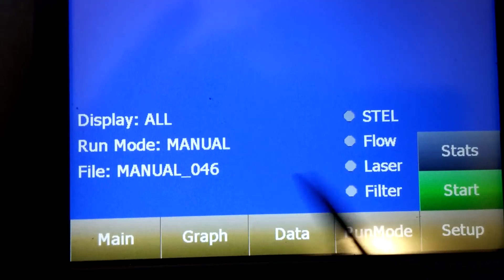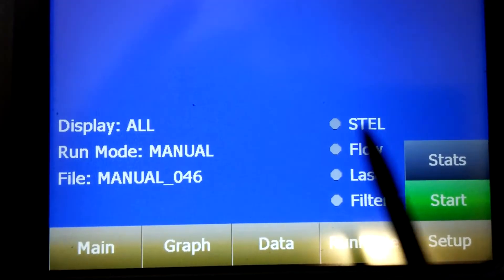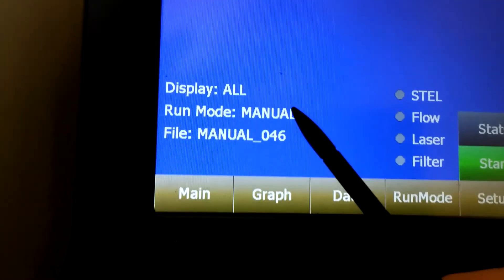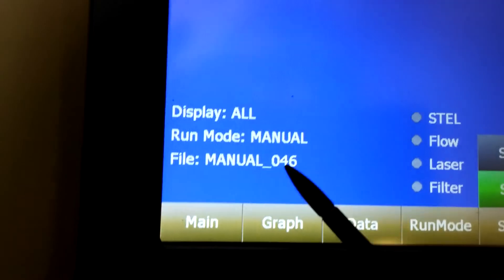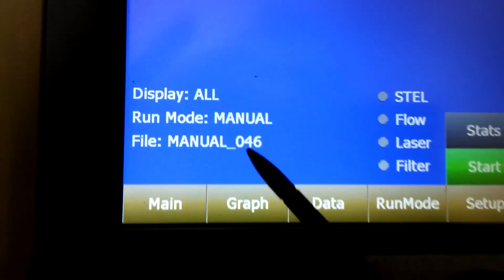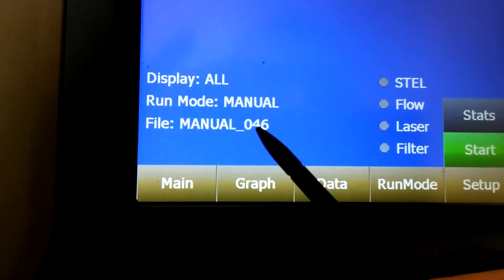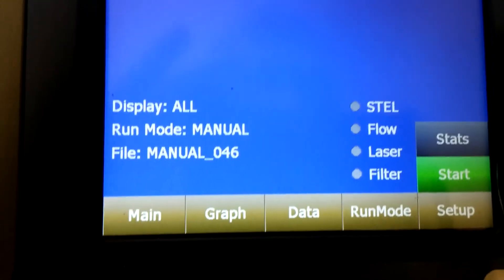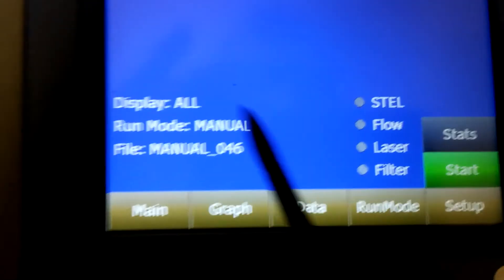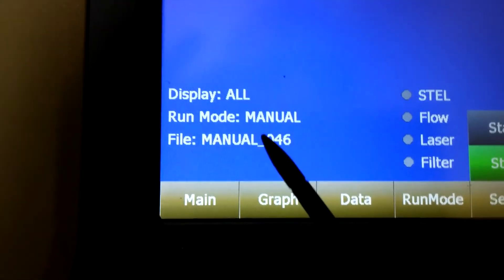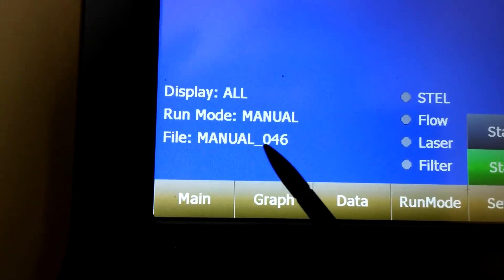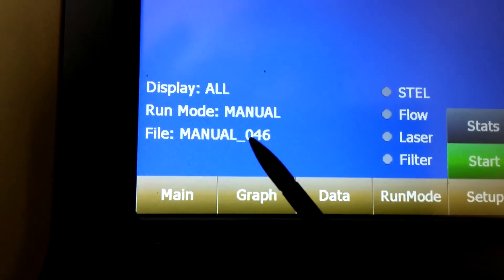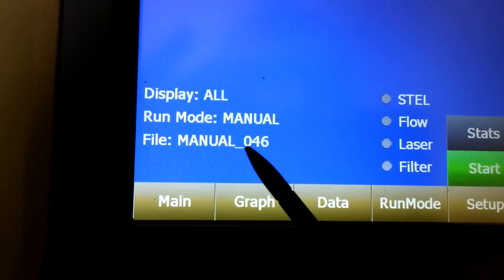The file is going to be the name of your file for your session once you start and stop it. That's going to be what your file name is for all your logged data.